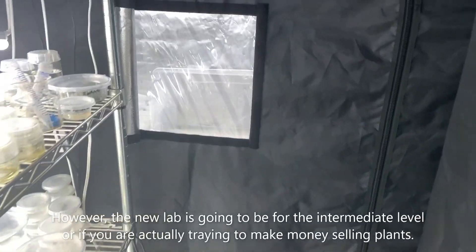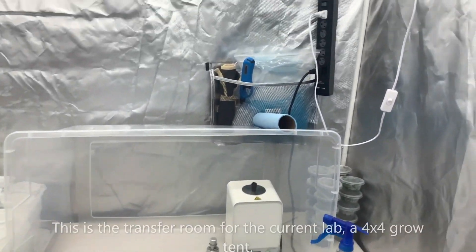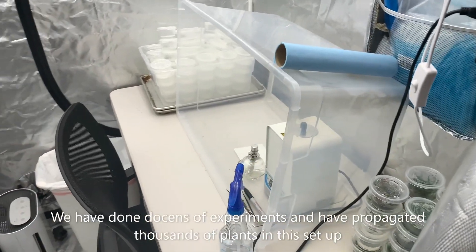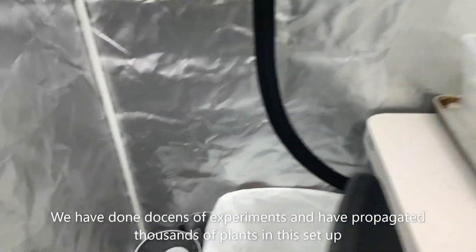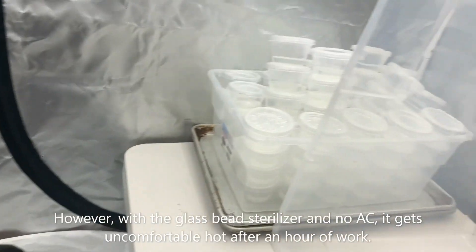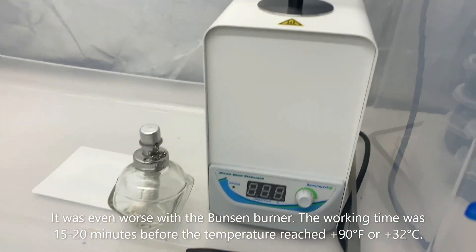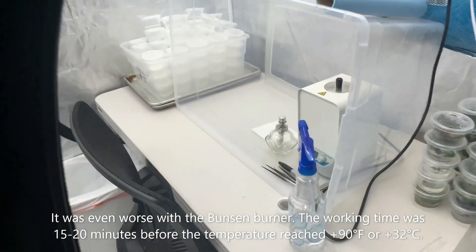The lab we're building is gonna be bigger and more sophisticated — perfect for intermediate to advanced level. This is our transfer room, our very small transfer room. We've done dozens of experiments and propagated thousands of plants in this setup. When you're in here propagating using the glass bead sterilizer with no AC, it gets really uncomfortable and hot almost immediately. It's even worse with the Bunsen burner on because I turn it on about 15 to 20 minutes before and the temperature gets to 90 to 100 degrees.